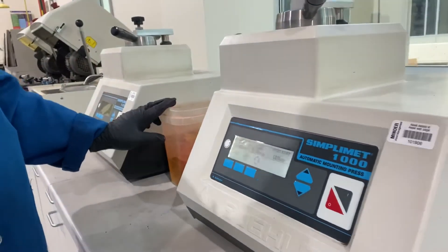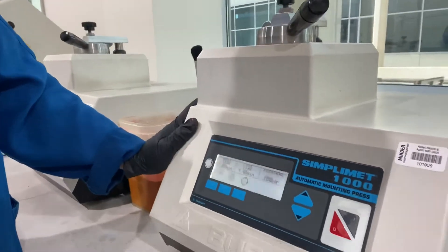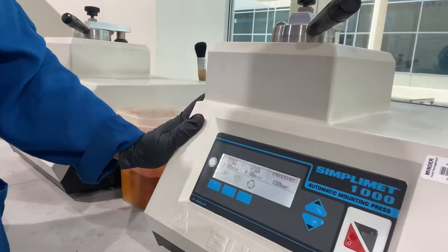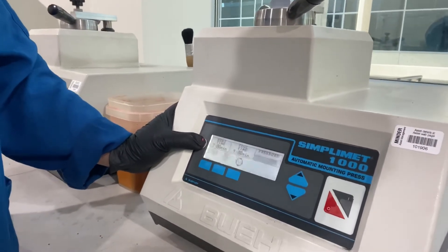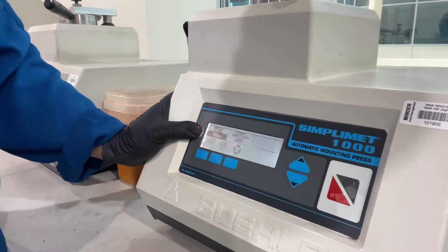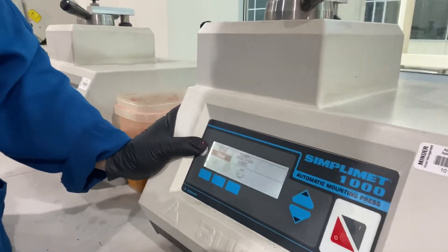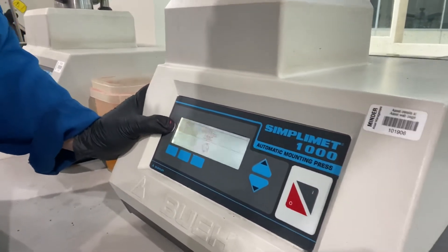Before running the machine, set the heating time to three minutes, cooling time to four minutes, pressure to 180 bars, mold size to 40 millimeter, and the heating temperature is 180 degrees Celsius.